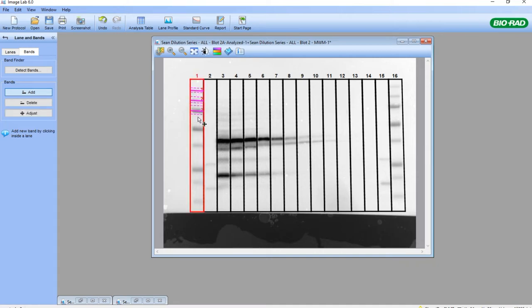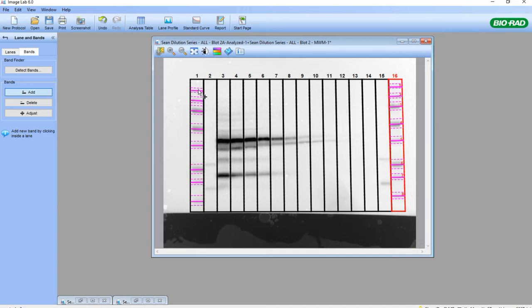I'm going to click on my marker bands and then go into the last lane and do the same thing. This will permit a more accurate molecular weight analysis because, as you can see, the markers in this lane are slightly higher than the markers in the other lane. That's simply because of how the transfer was performed — the gel was probably not in perfect square orientation on the membrane. This is why it's useful to have a marker in multiple lanes on a gel, so you can get more accurate molecular weight analysis.